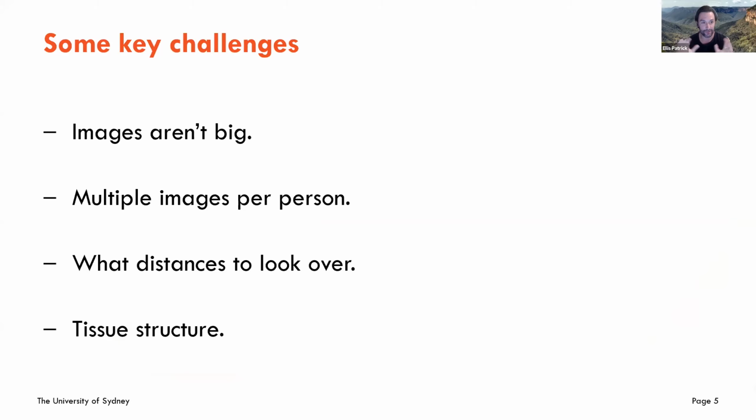If you're measuring lots and lots of markers, which is the great thing about these technologies, you also have the capacity to start deeply phenotyping cells and potentially splitting them up into more and more cell types. You can imagine that if you've been able to identify 50 different types of cells, but you've only measured 2,000 cells, that cell number starts to drop quite quickly. That creates some problems in how you're analyzing things.